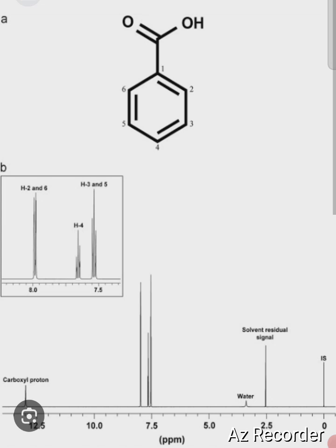This first peak which is situated at 0 ppm is nothing but the TMS signal. Then this peak is the residual DMSO peak, and this small peak is moisture present in the DMSO solvent.